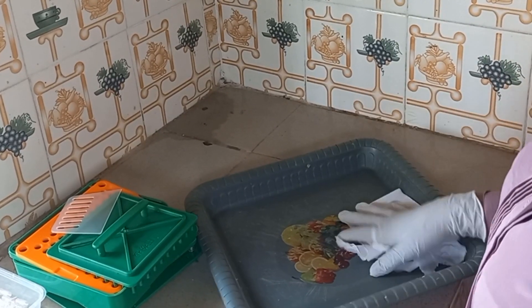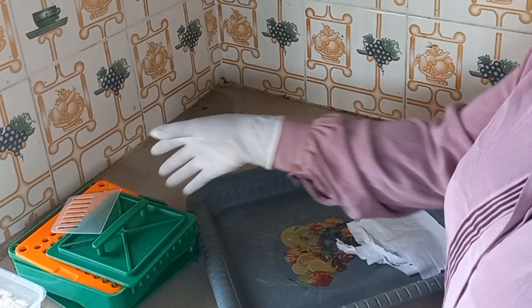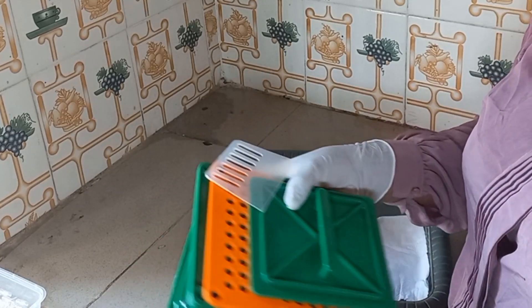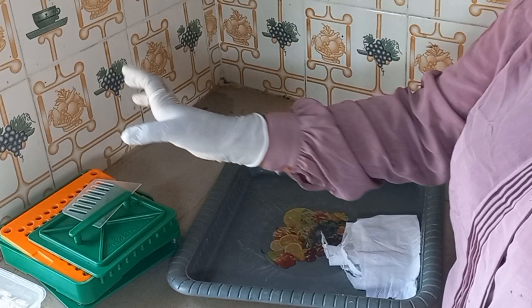Hello everyone and welcome to my YouTube channel. Today I'll be teaching us how to make use of a capsule peeling machine. So many people don't know how to make use of this capsule peeling machine, so today I'll be teaching us how to use it.